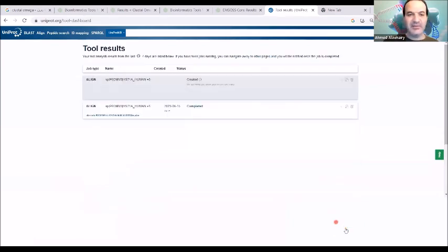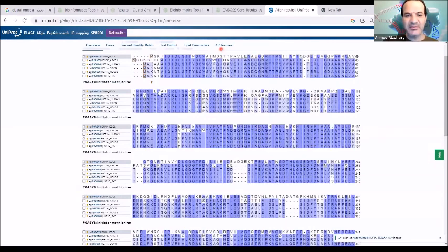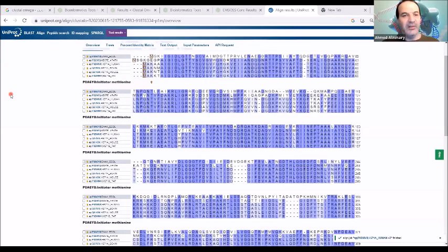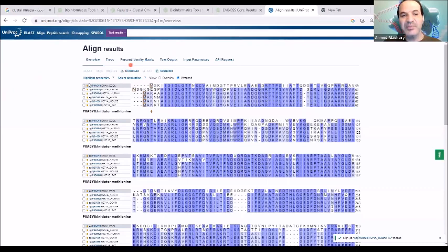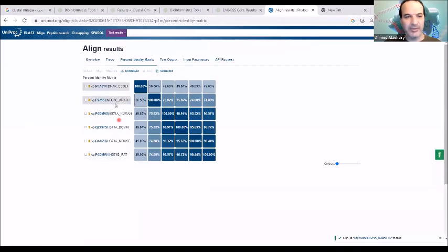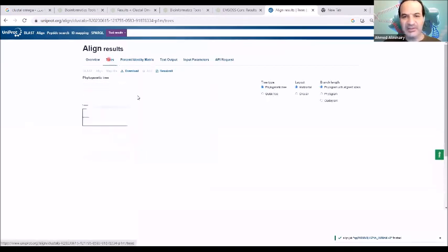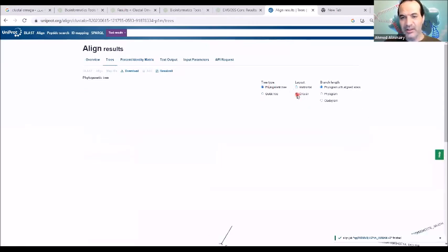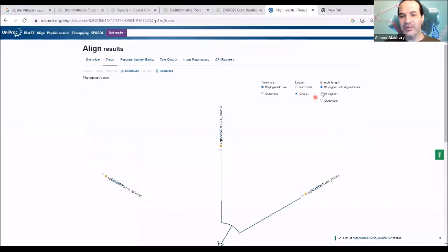These six sequences will be aligned very easily. It will show you the similar positions between these sequences. If you would like to see where the hydrophobic region is, how many positions are hydrophobic or hydrophilic, all this information can be extracted. You can also see the percent identity between these sequences, and extract a guide tree or phylogenetic tree, shown horizontally or circularly.